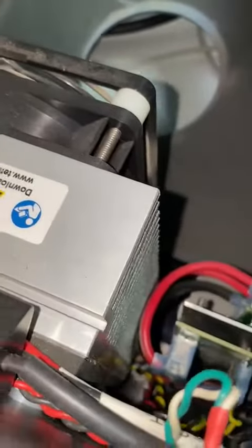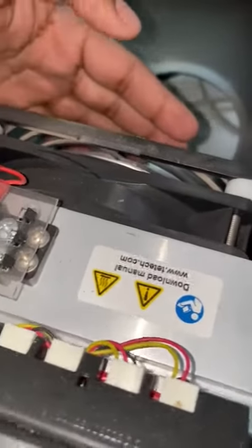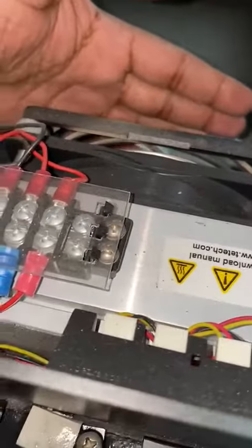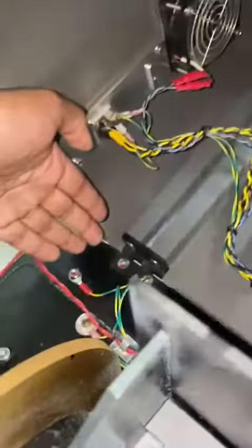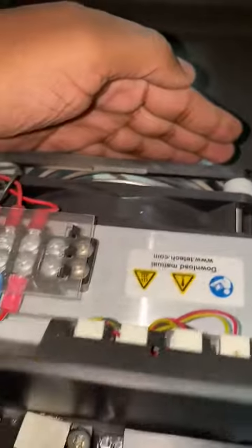The fan is okay, it is in operation — I'm feeling air here and here. The spine is in working condition, so you're getting airflow here. Check here — it's okay.